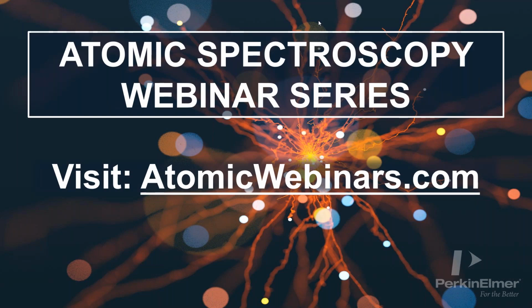And then, when you're rinsing, did you look at the rinsates and see if there was any platinum in the rinsate? Sometimes when we do that, we take the rinse solution and make sure that there's no target element, in this case platinum, in the rinse, to prove that we're rinsing properly and that we're only looking at the metal within the cell rather than around the cells. There are a few variables, and if you're doing cytometry on it somehow, what's the error there, etc.